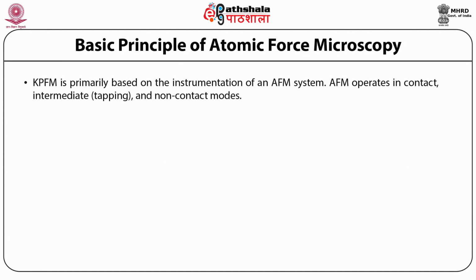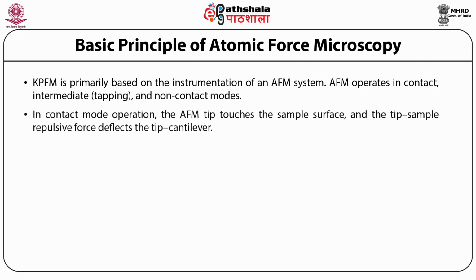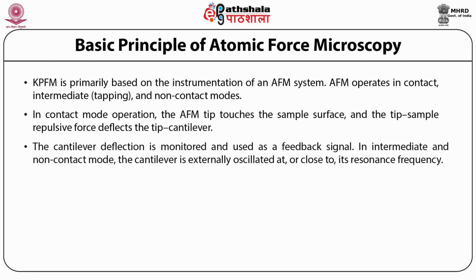KPFM is primarily based on the instrumentation of an AFM system. AFM operates in contact, intermediate, tapping, or non-contact modes. In contact mode operation, the AFM tip touches the sample surface and the tip sample repulsive force deflect the tip cantilever. The cantilever deflection is monitored and used as a feedback signal.